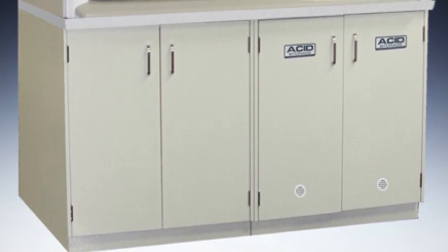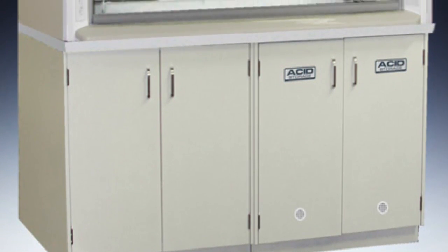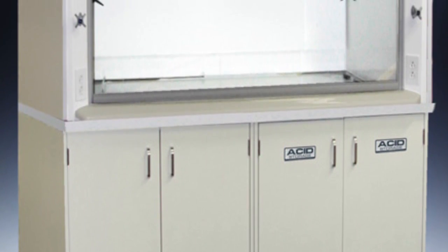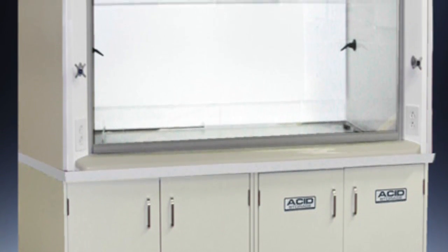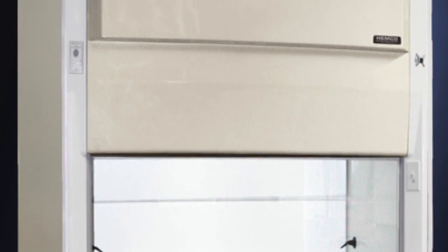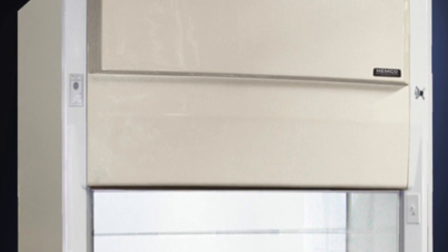Acid digestion fume hoods are constructed with acid-resistant materials, such as unplasticized PVC. Other materials, such as PVDF, may be used for acid digestion applications involving high service temperatures. Sashes may be made out of polycarbonate to resist hydrofluoric acid etching.